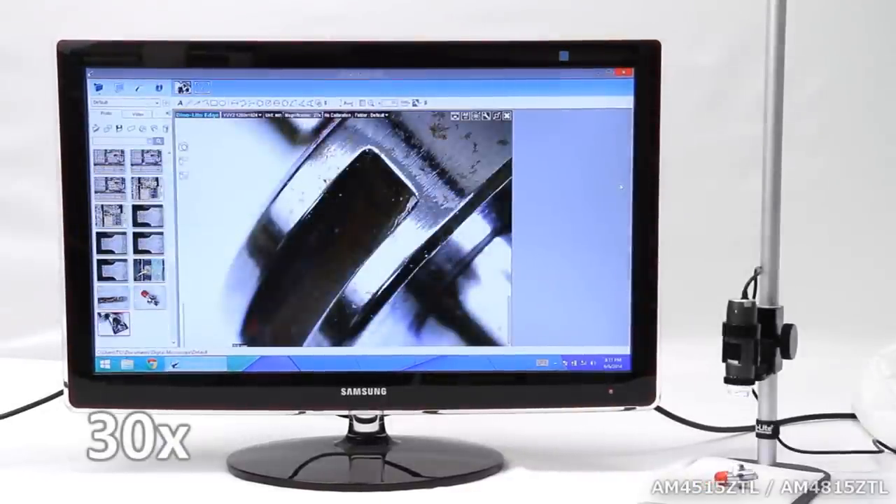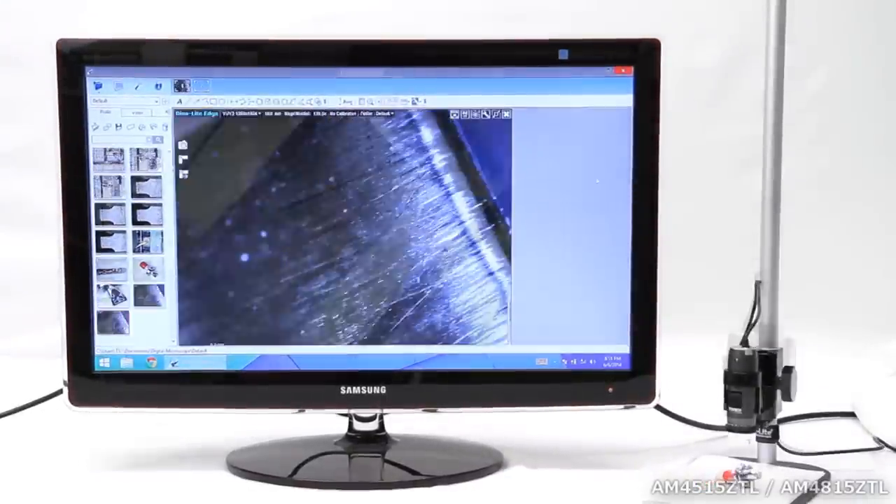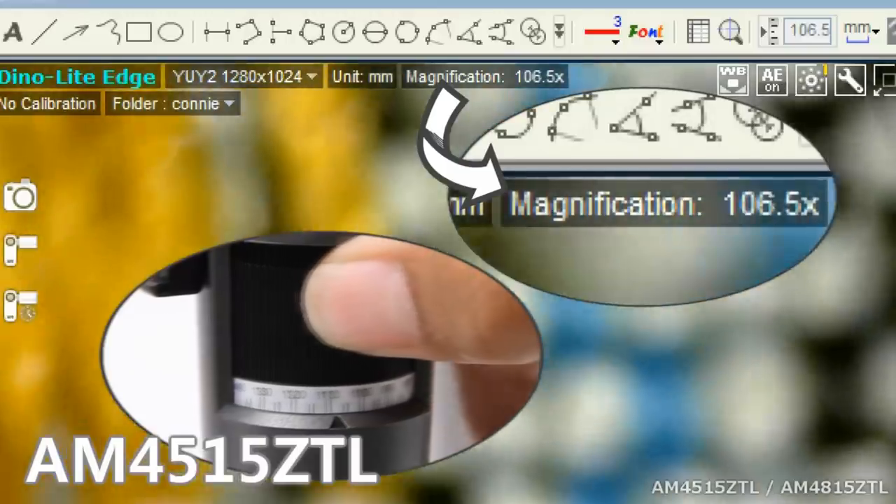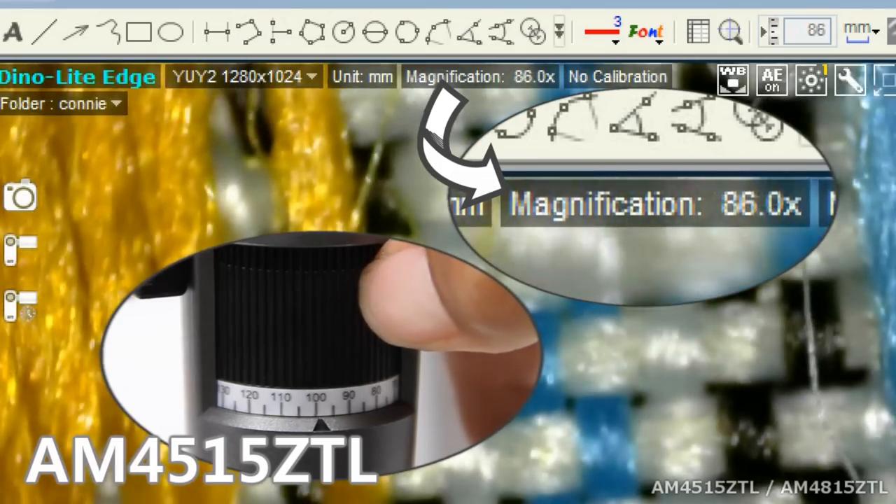The AM4515ZTL has AMR, or Automatic Magnification Reading, which displays the magnification in the DynoCapture 2.0 Live View window.